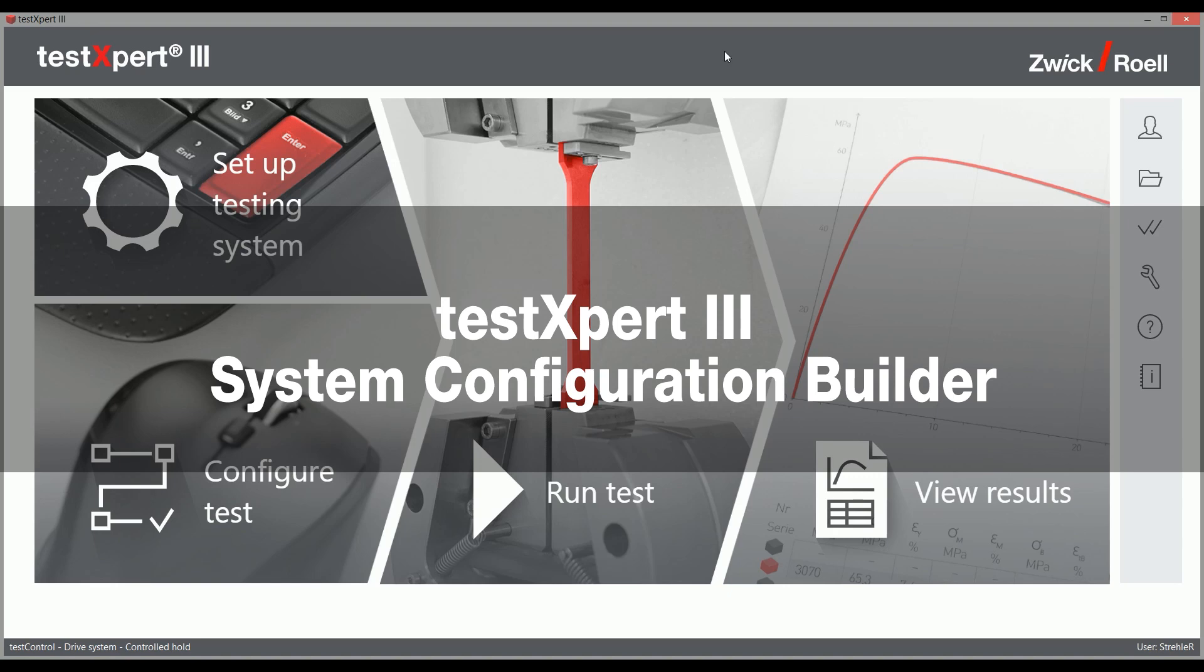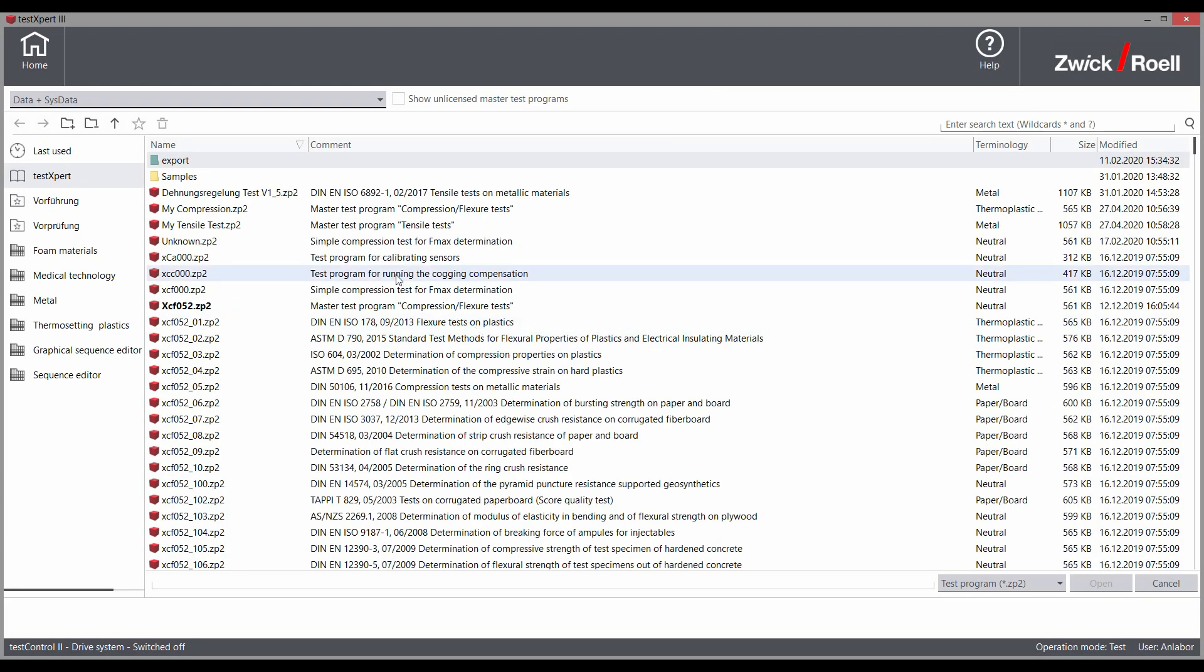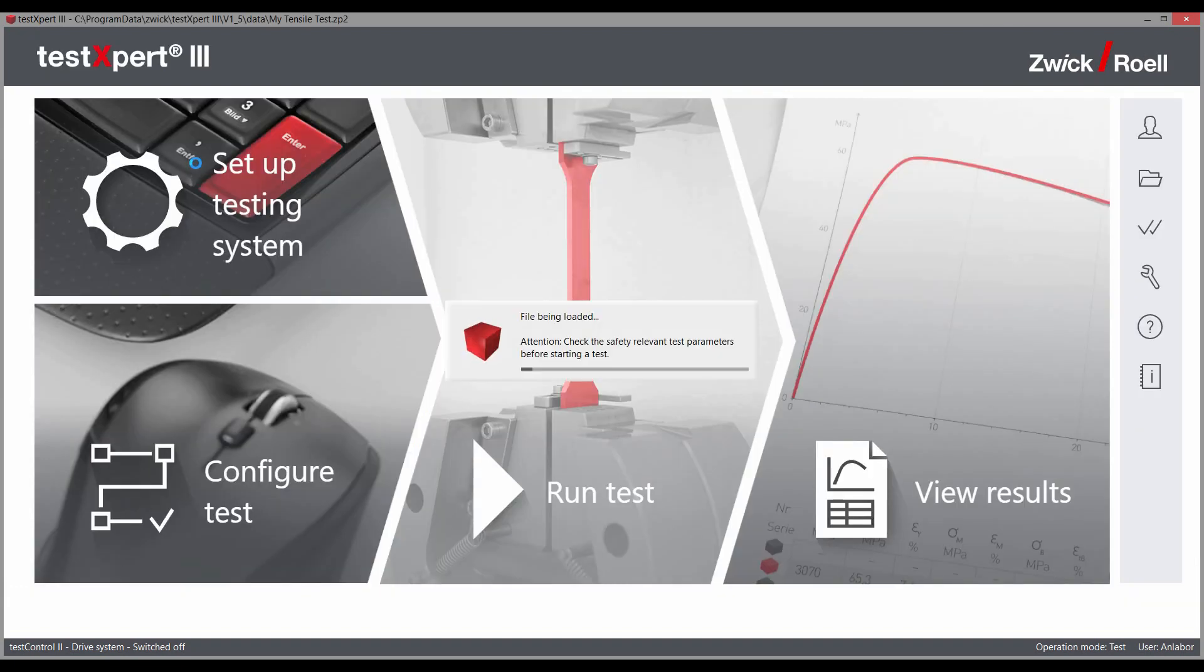This system configuration is coupled with a previously selected test program. When loading the test program, all saved settings are automatically loaded, allowing the operator to get started immediately.